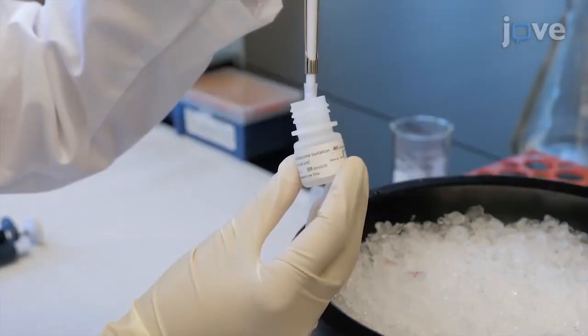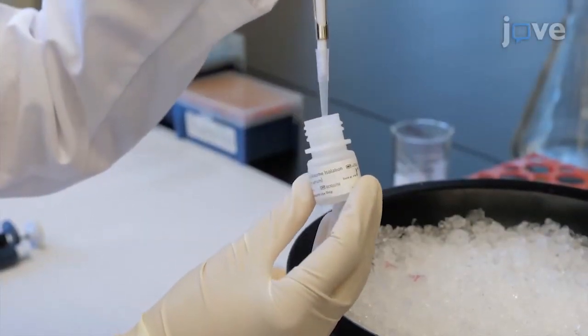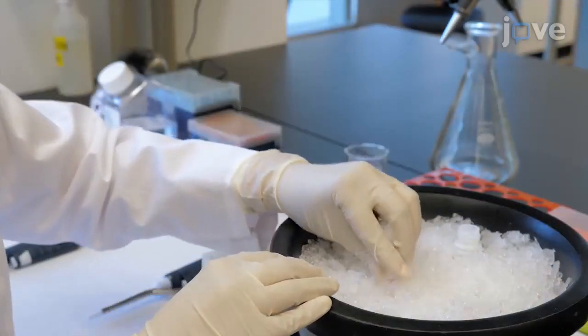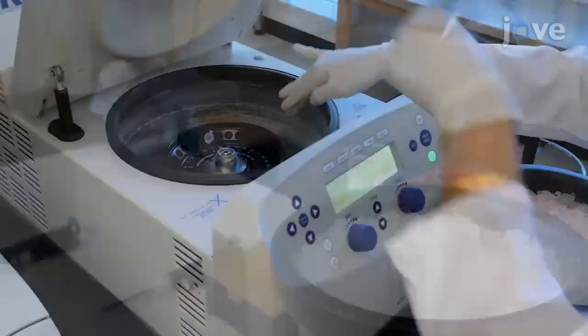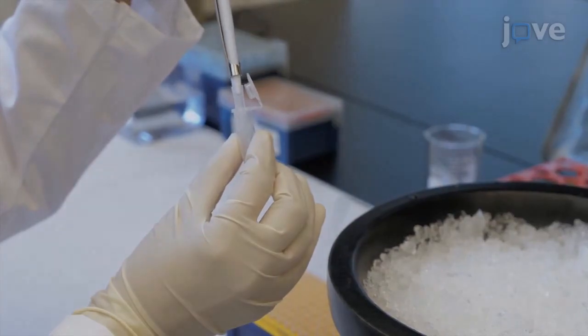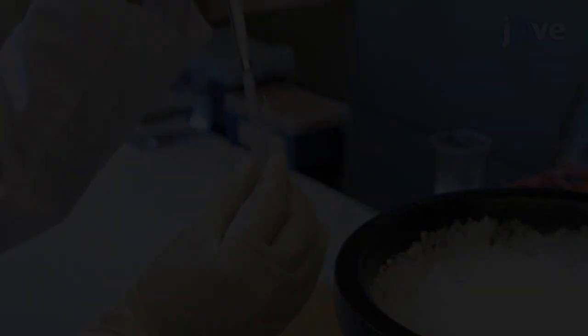Add 30 microliters of serum exosome isolation reagent to the supernatant and incubate at 4 degrees Celsius for 30 minutes. Spin at 10,000 times G for 10 minutes. Collect the EV depleted supernatant carefully without disturbing the pellet.